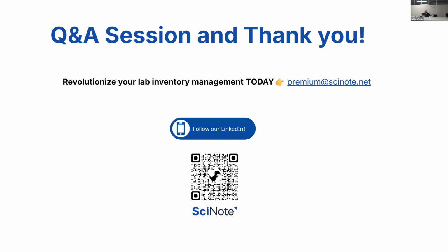Alex, can one create tasks based on specific sample supplies in inventory? I would probably need more information on this one. You can connect. We have a very good system of connecting experimental data and task system with inventories, but it's actually done from the task system. So you're in the task and you assign those items, and you can also create them from there. My first thought is yes, but I may have misunderstood your question.